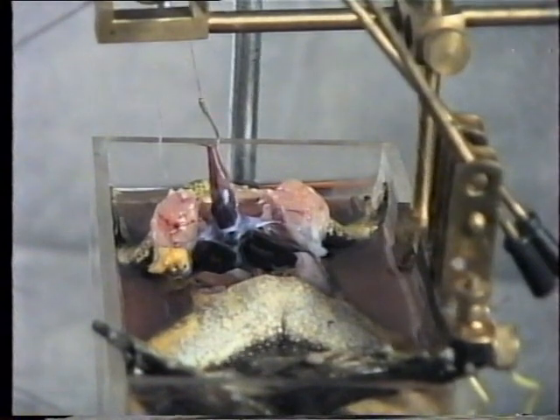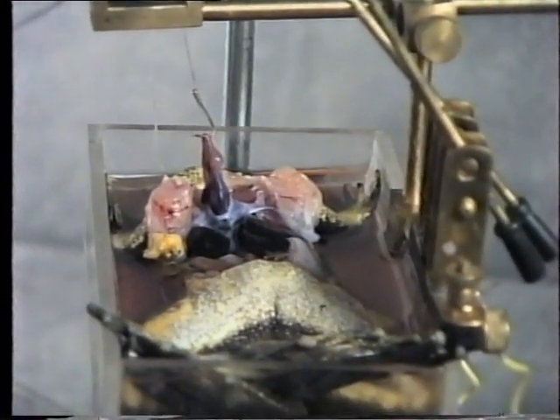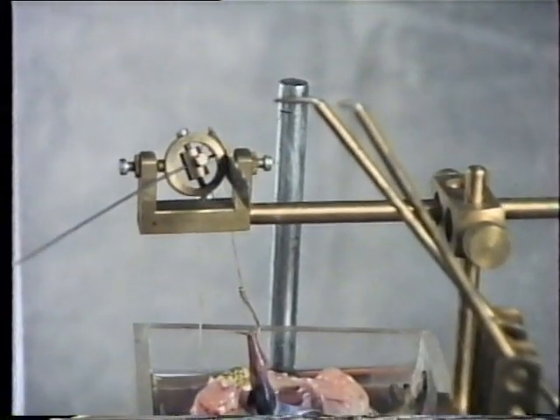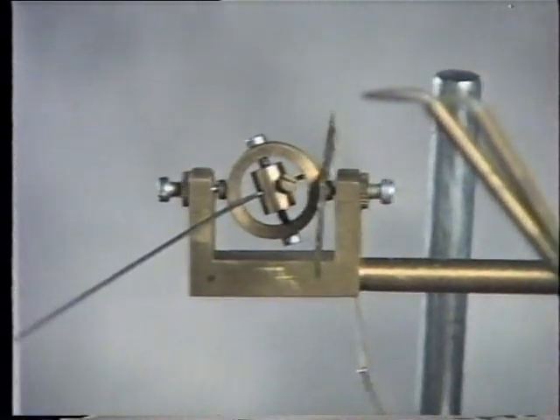Now place the frog in the tissue chamber filled with Ringer's solution. Tie the free end of the thread to the lever with proper tension. Set the drum to medium speed and record the normal heartbeat.